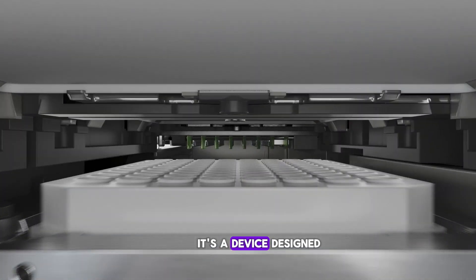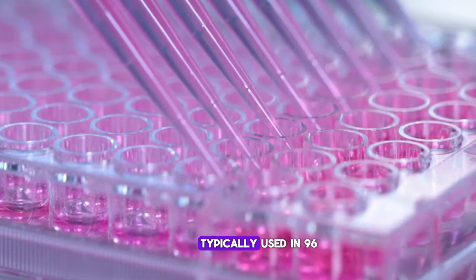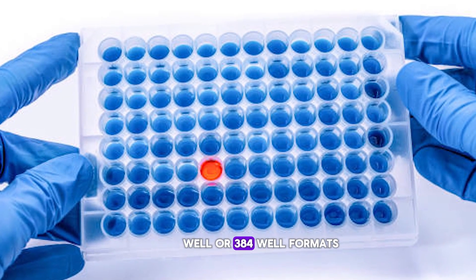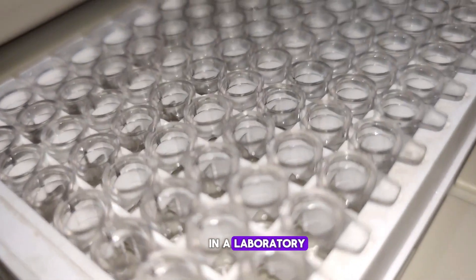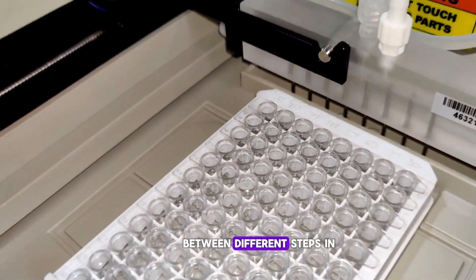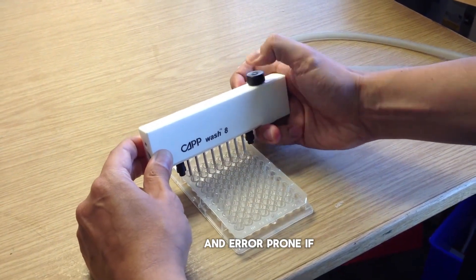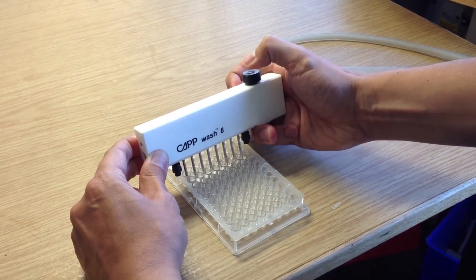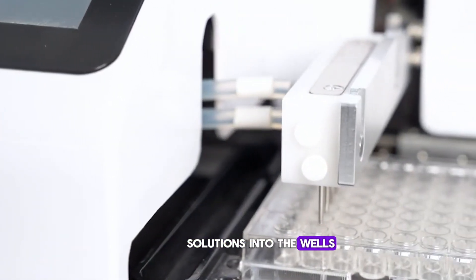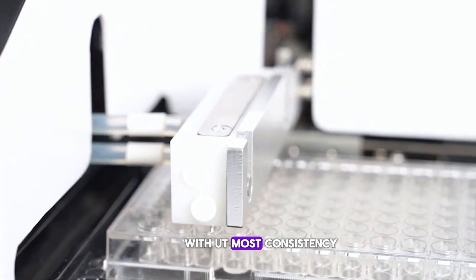Simply put, it's a device designed to automate the washing process for microplates, typically used in 96-well or 384-well formats. In a laboratory, these wells are filled with samples that need to be washed between different steps in assays like ELISA assays. This machine performs tasks that would be tedious and error-prone if done manually. The washer introduces buffer solutions into the wells, removes waste, and repeats the process with utmost consistency.